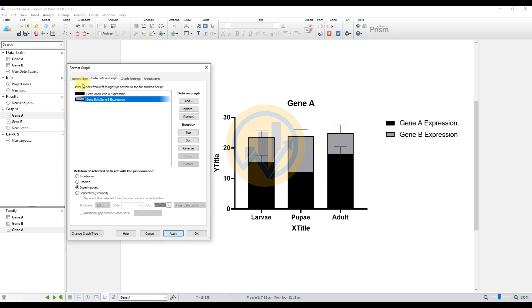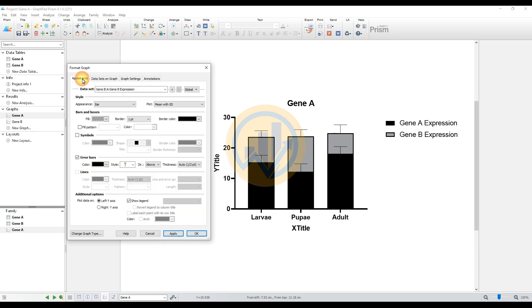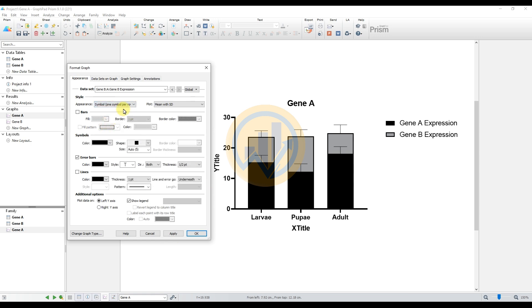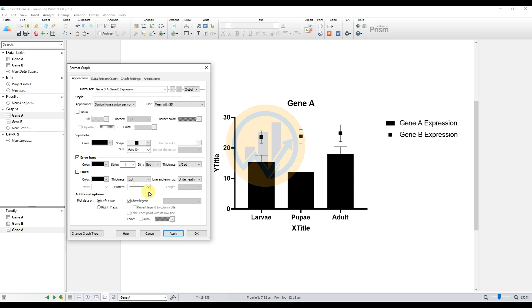Go to the Appearance menu and select the Style option under Appearance. Change to the Symbol option, then click the Apply button to update the symbol style.